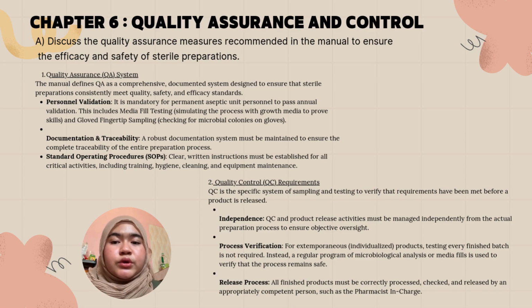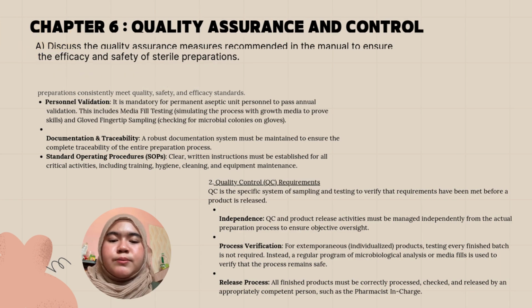Next, quality control or QC focuses on verifying that requirements are met before product release. QC activity must be independent from the preparation process to maintain objectivity. For extemporaneous preparation, routine microbiological testing or media fill programs are used instead of testing every batch. Finally, all products must be checked and released by a competent person such as the pharmacist in charge.